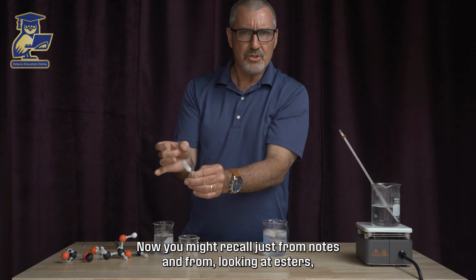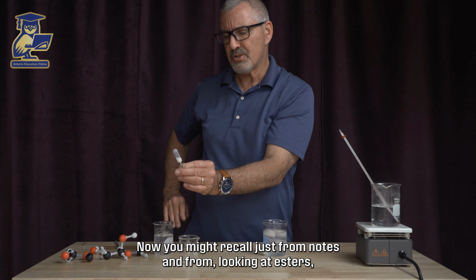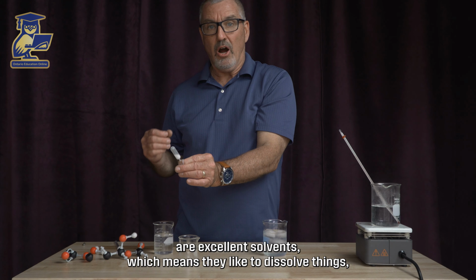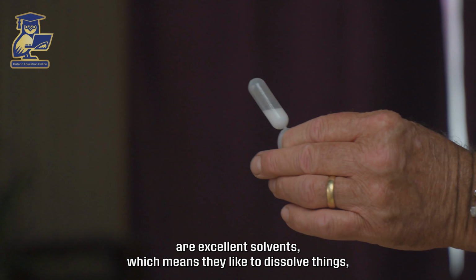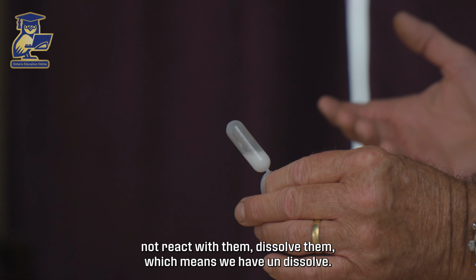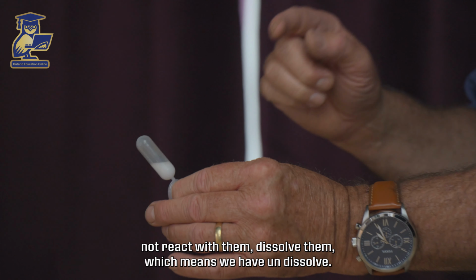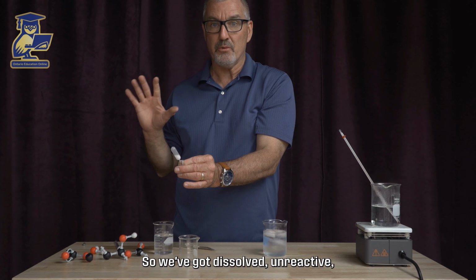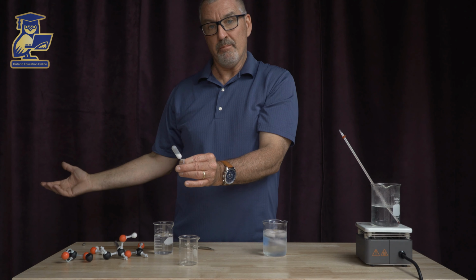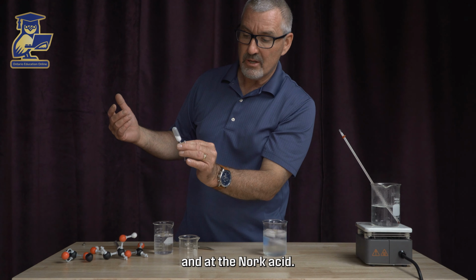Now, you might recall just from notes and from looking at esters, esters are excellent solvents, which means they like to dissolve things, not react with them, dissolve them, which means we have dissolved, unreacted 1-pentanol and ethanoic acid.